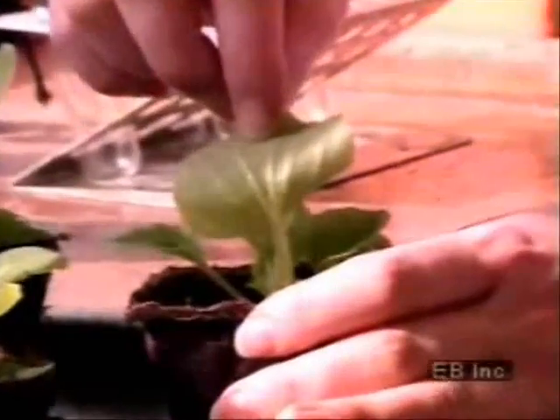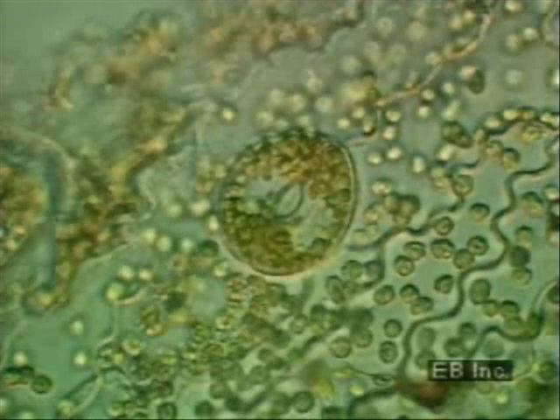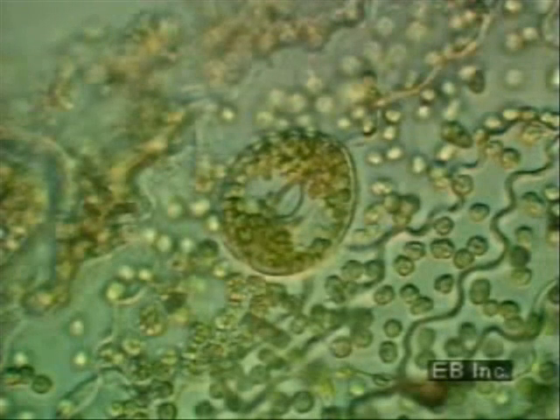This begonia plant, like most land plants, has more stomata on the underside of its leaves than on the top. The stomata control transpiration as well as the exchange of gases within the plant. The stomate is like a pore. Two cells called guard cells surround the stomate and can open and close in response to the amount of water in the plant, the light intensity, and the level of carbon dioxide in the air.